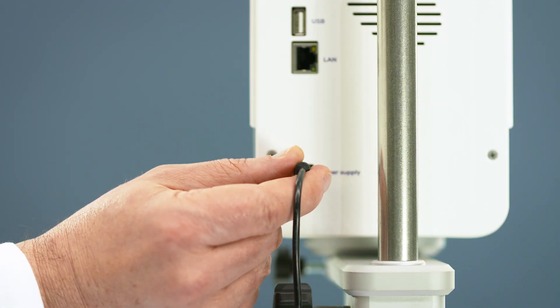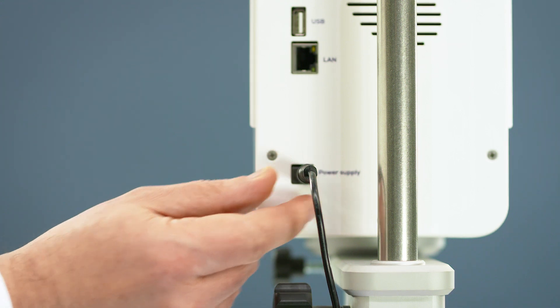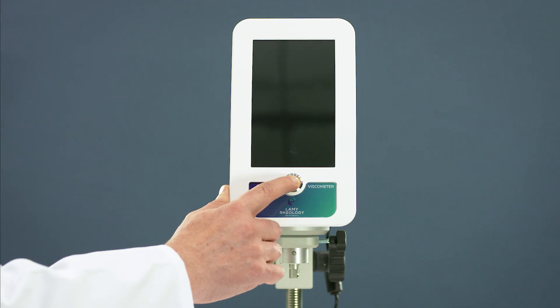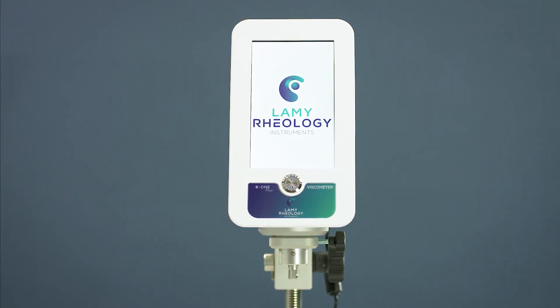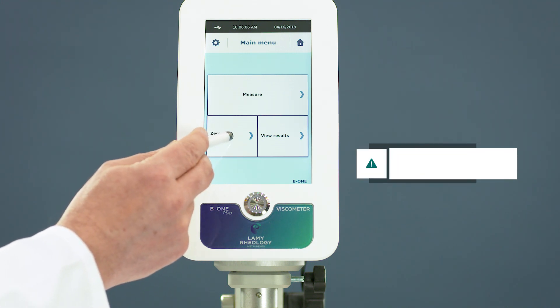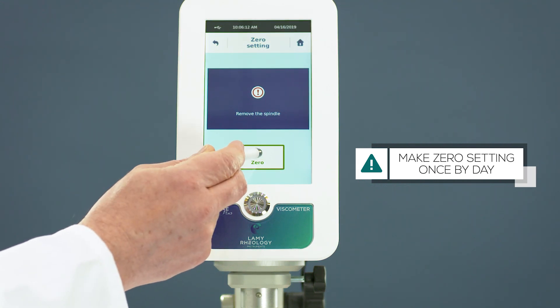Plug the power supply into the rear panel of the device and switch on the B1 Plus. Zero the device — you should do this at least once per day.